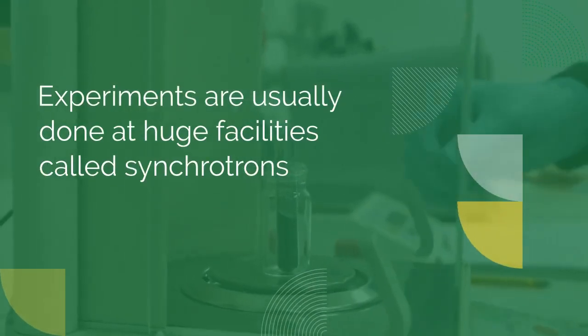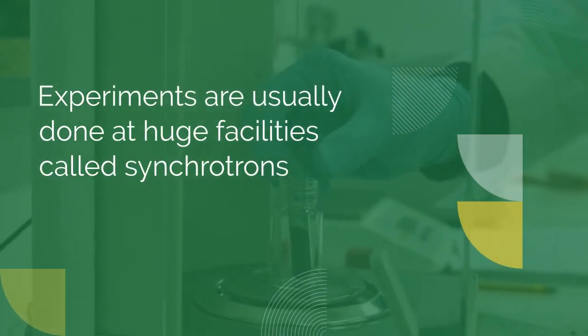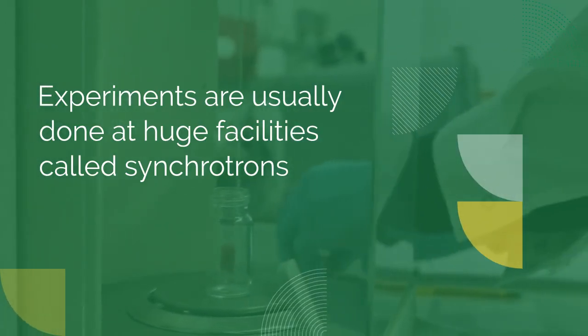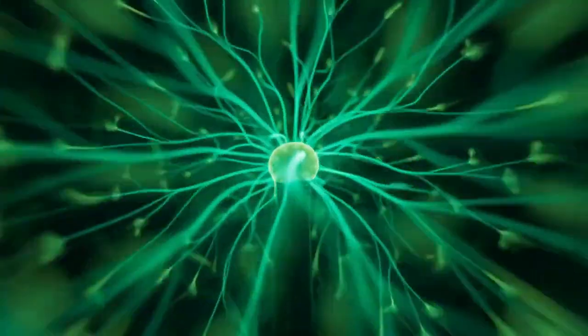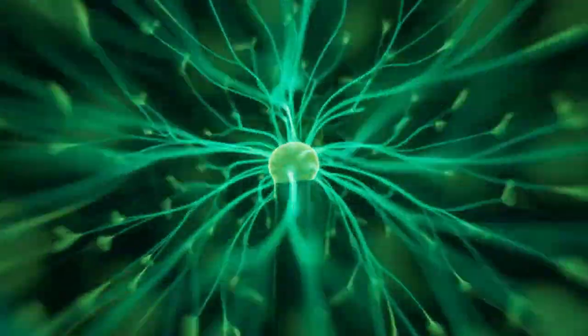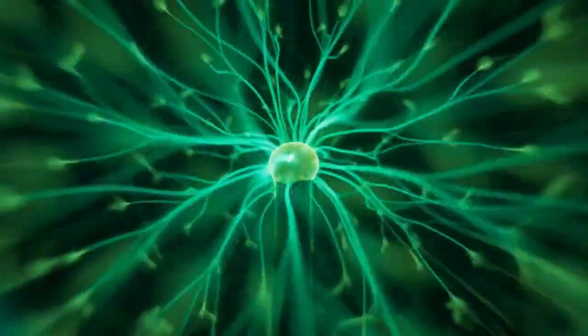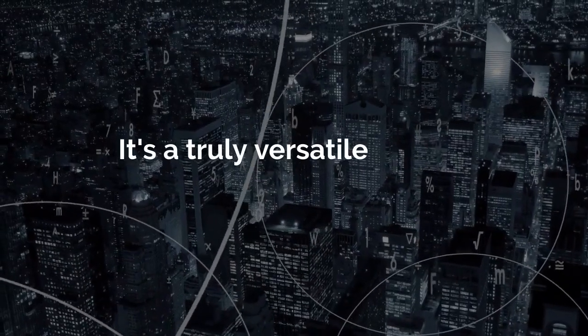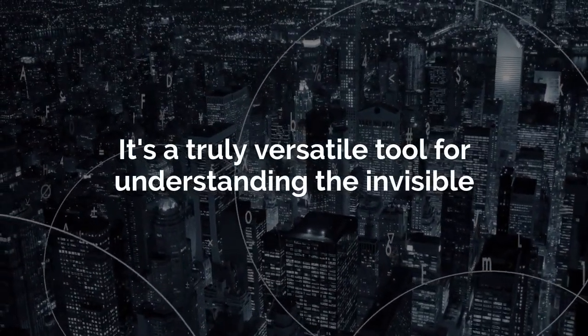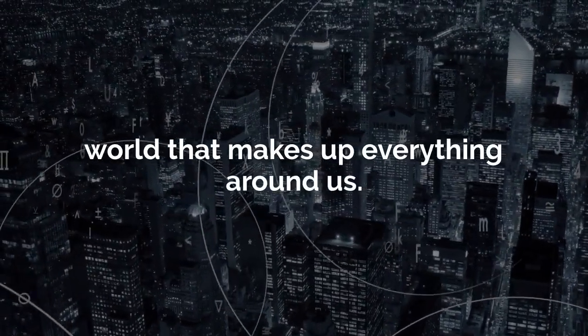Because this technique requires very bright and tunable X-rays, experiments are usually done at huge facilities called synchrotrons. Scientists use XAS to solve all sorts of problems, from designing better batteries and more efficient catalysts to studying how pollutants behave in the environment. It's a truly versatile tool for understanding the invisible world that makes up everything around us.